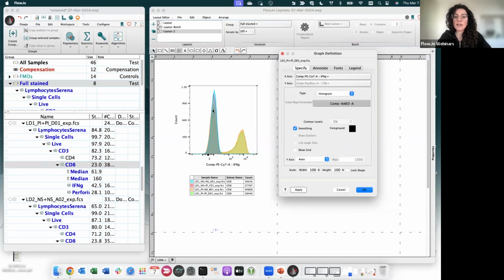As you can see, the negative peaks are not all aligned. I can apply a sort of normalization to that and have all the negatives aligned by using, on the y-axis, the modal option. This will bring the first peak, the one that you have in the front, to fill to 100%, and then adjust all the rest. If I apply that, now they are all the same.